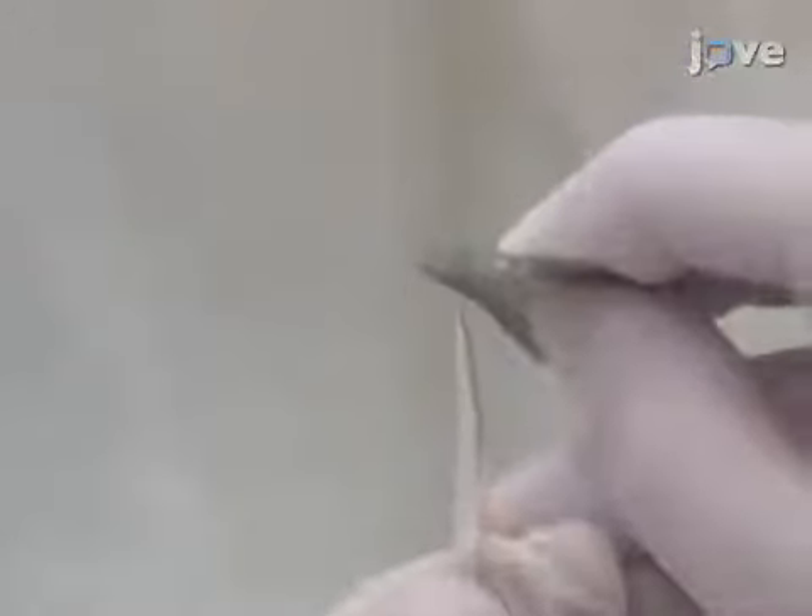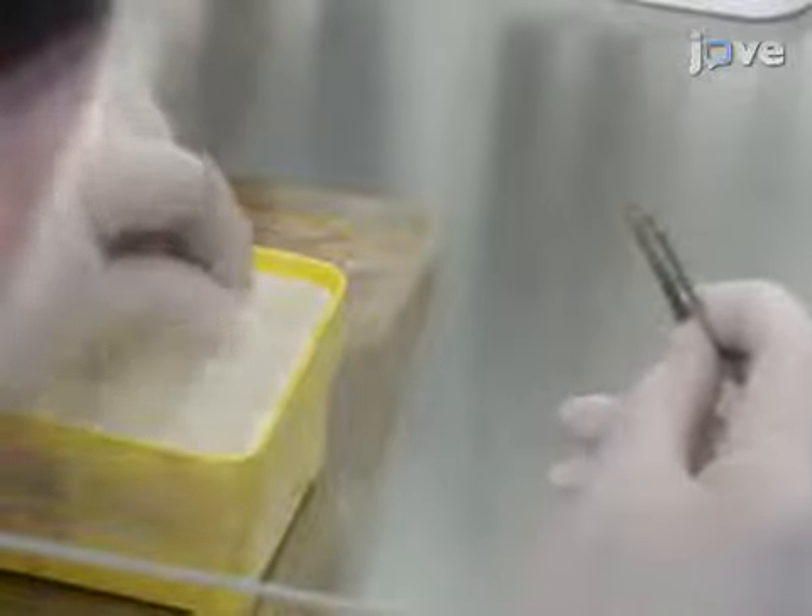Then use a razor blade to cut approximately 30 100-microliter micropipette tips approximately 1 mm from the tip to widen the tip openings, and return the tips to the pipette tip rack.